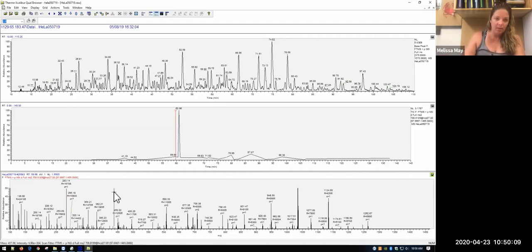We are lucky that we have a software program that does this for us. So previously, before Proteome Discoverer or some of these software programs were generated, people had to go through and manually annotate all of these and figure out what the peptides were. I think students do it in some of the organic chemistry classes. Proteome Discoverer does this for us. And so we don't have to worry about figuring out what the peptide sequence is. We can just use this again as kind of a way to troubleshoot whether or not the instrument is working.